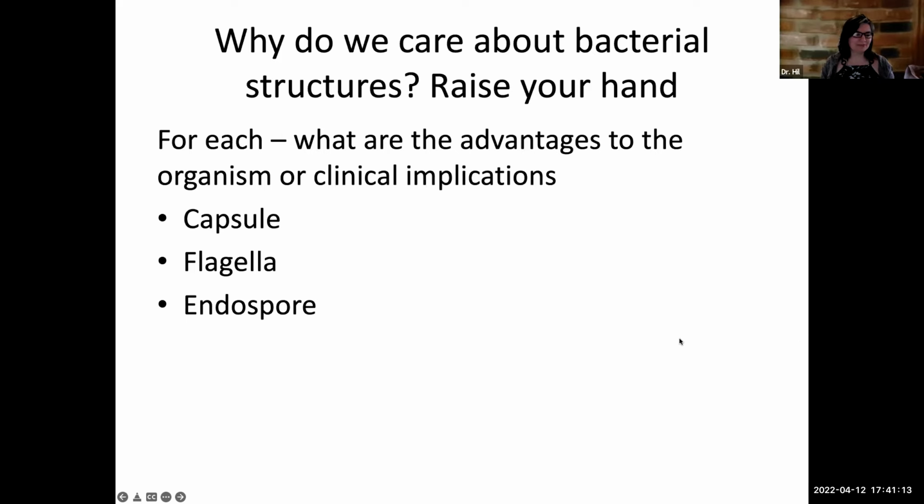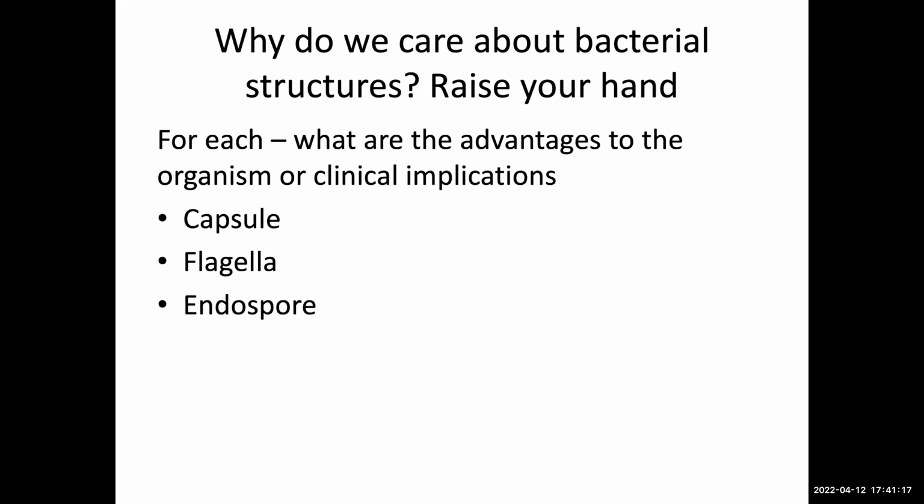Sarmeet, go ahead. I guess the reason for that is so that we can differentiate them from the other microbes that are present in the slide, or maybe the selected slide. The ones that do not take the stains easily. In order to differentiate that, we use different procedures: capsule, flagella, endospore, and that's how we get to know, we can categorize which microbe is present in which slide.